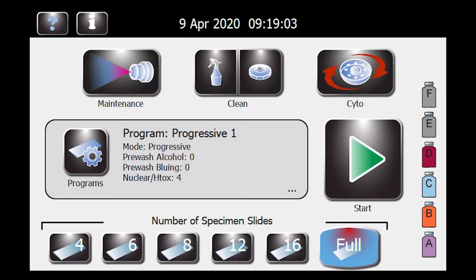We wanted to walk through the GUI and show you what the settings do. The main screen is pretty similar to other instruments — we utilized as much as we could for it to be familiar to start and run a program.